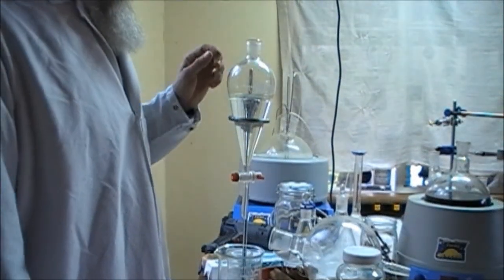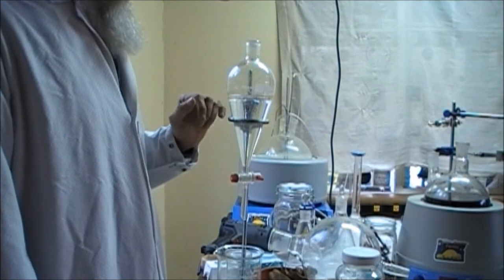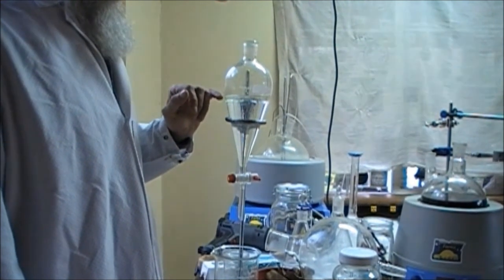So now we're going to use this separation funnel to separate the hydrosol from the essential oil that's floating on top of it.